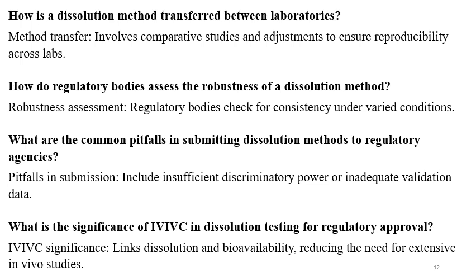What are the common pitfalls in submitting dissolution methods to regulatory agencies? Common problems are insufficient discriminatory power or inadequate validation data. Also, a study on solubility, equilibrium solubility and BCS solubility should be submitted in the dissolution method development. What is the significance of IVIVC in dissolution testing or regulatory approval? IVIVC links dissolution and bioavailability, reducing the need for extensive in vivo studies.